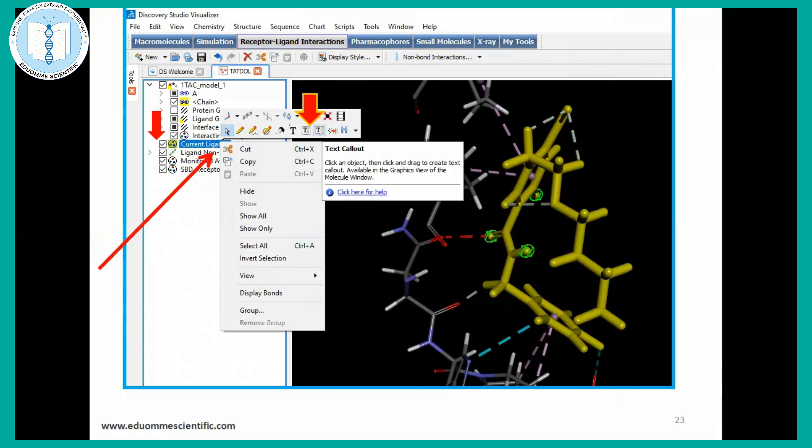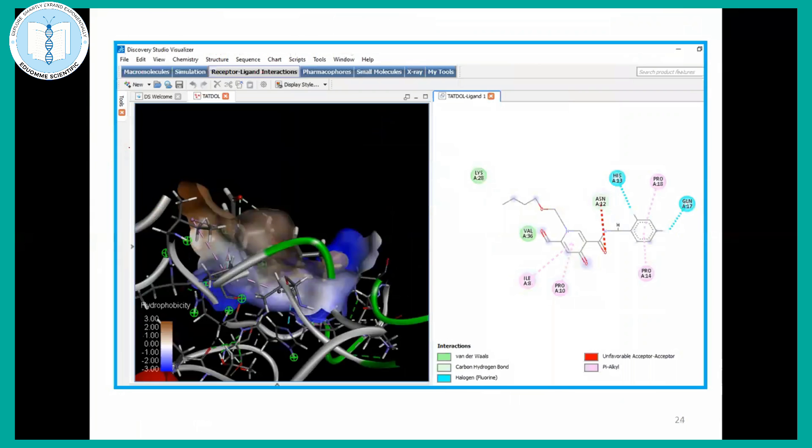If you want to provide the namings and the texts around those interaction, that also can be done from here. You can get your 3D and 2D interactions also, which you can utilize for your publications.